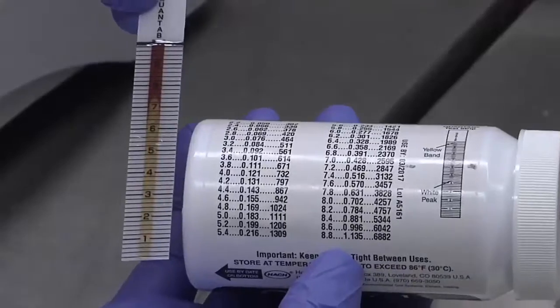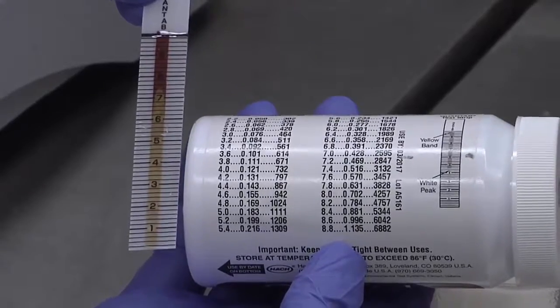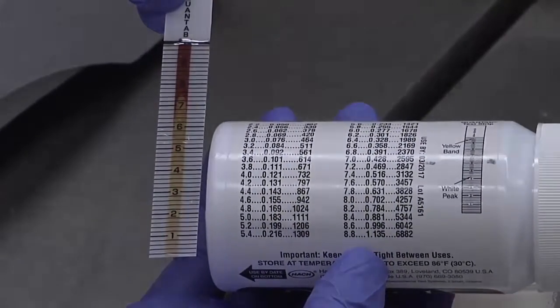The reading on the test strip can be converted to percentage sodium chloride by reading the table on the back of the test strip bottle.